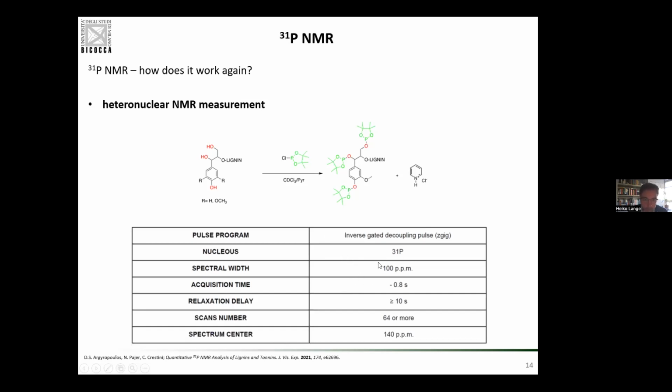On this slide, without going into details, I just re-report from this publication the key aspects, and those shouldn't be changed, because if I change my parameters of acquisition in the NMR, I change eventually my NMR outcome, and that is one of the points that will come up once in a while during this seminar, that you have to have a certain type of standardization.